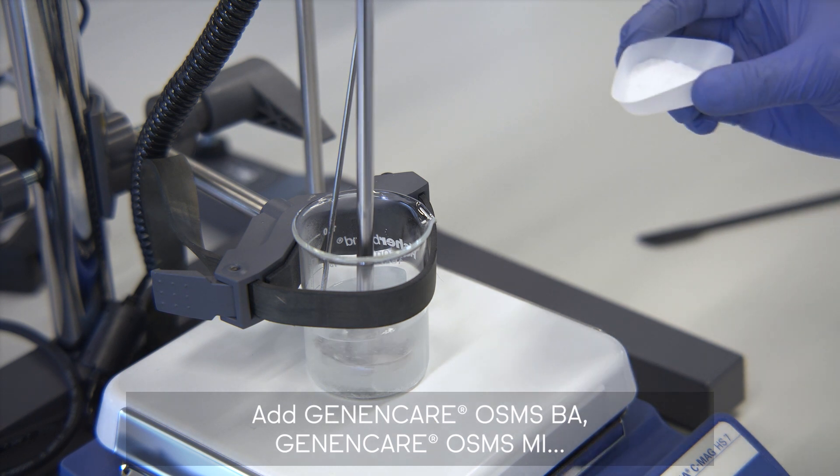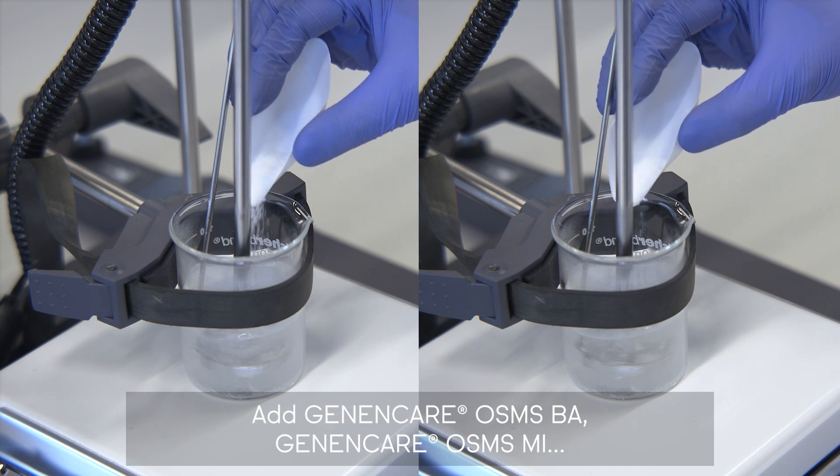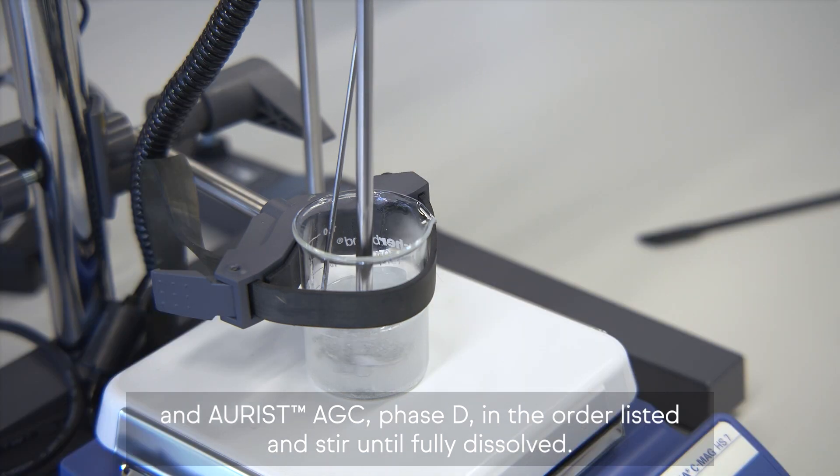Add GENENCARE OSMS BA, GENENCARE OSMS MI, and AURIST AGC Phase D in the order listed and stir until fully dissolved.